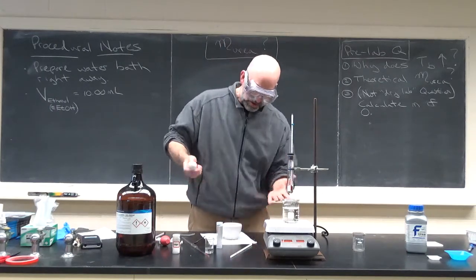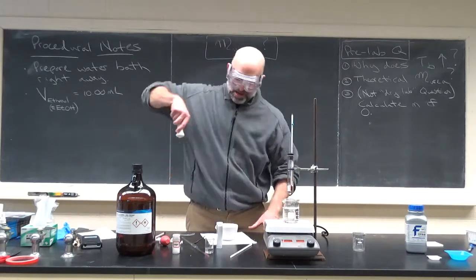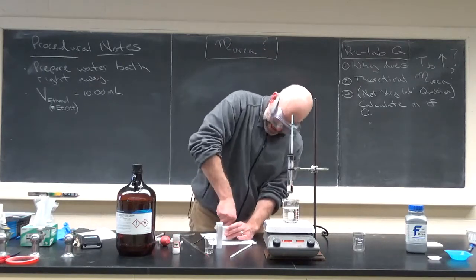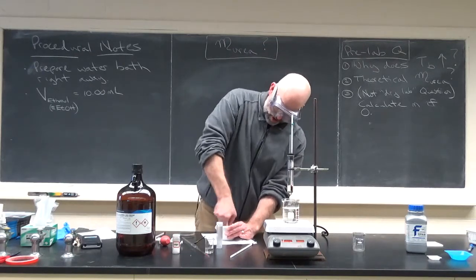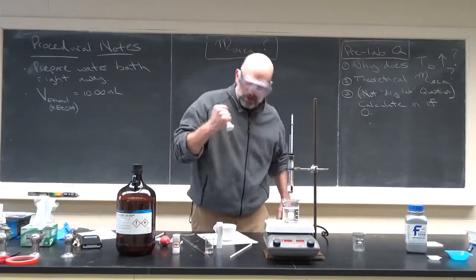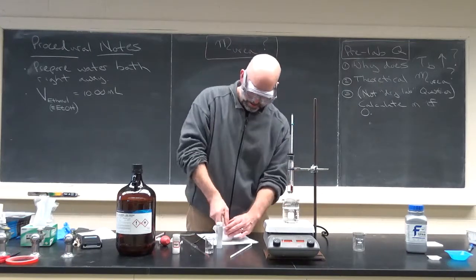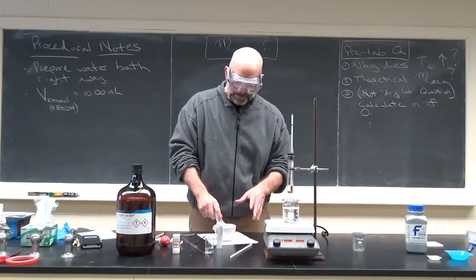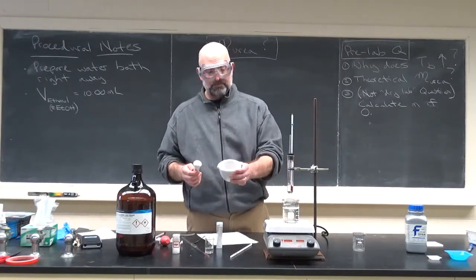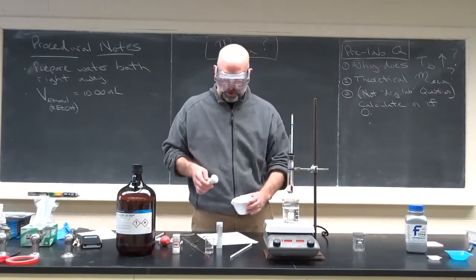So leave the mortar on the bench, and you push down and turn with the pestle. So you push down and you turn. What you don't do is get all jackhammer on it, or attack it like you're stabbing it. So don't get all stabby. All right, so you grind it up. It's like a spice grinder if you do any cooking at home. So now it is a fine powder, which is going to dissolve much more quickly.